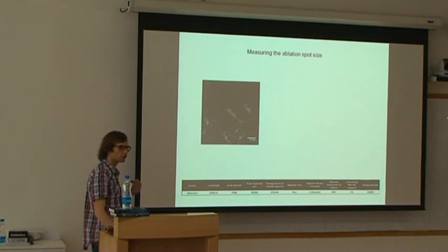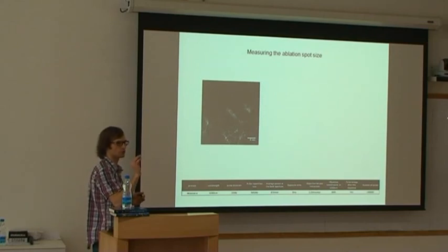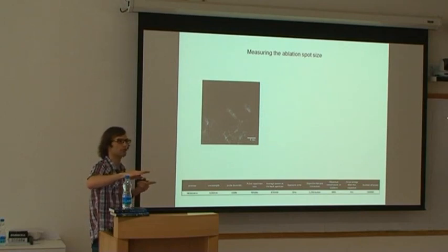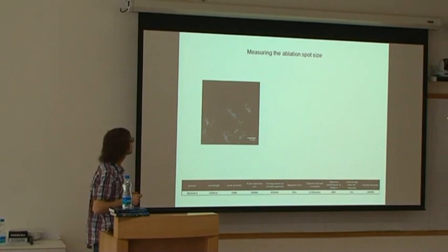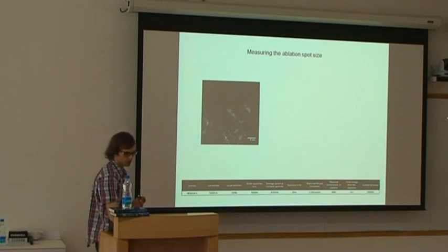So then I went on and tried to better characterize my tool. What I wanted to do is to try to measure the spot of ablation. How small was the spot? How big was the spot? This was quite challenging, because one good sample would have been, for example, a monolayer of fluorescent stuff. And by ablating this, you could measure the spot. The problem is that the samples or beads, for example, are not biological samples. So it was very important to do this kind of measure exactly within the Drosophila embryo to see what happens. So directly on actomyosin fibers, for example.